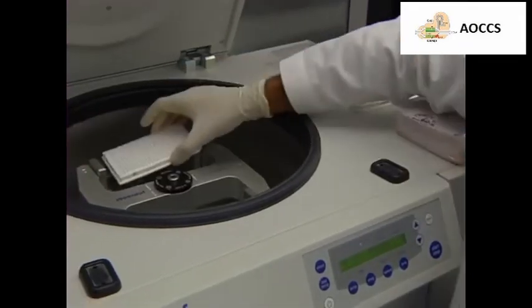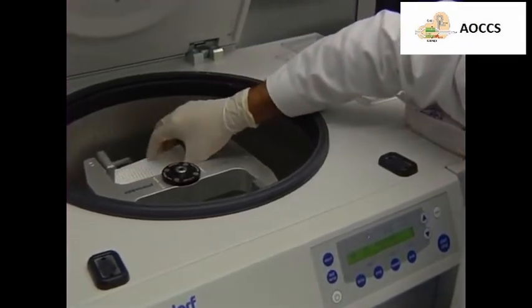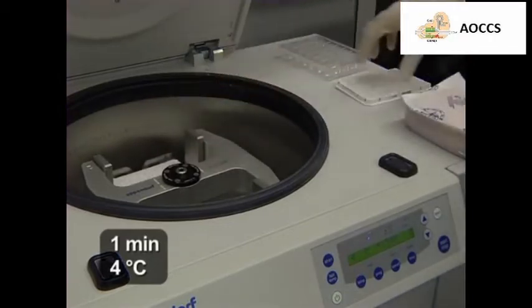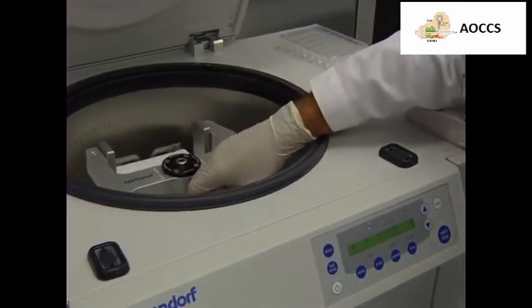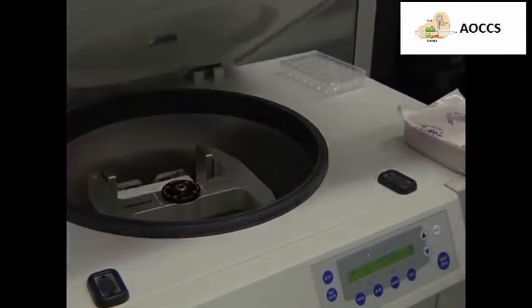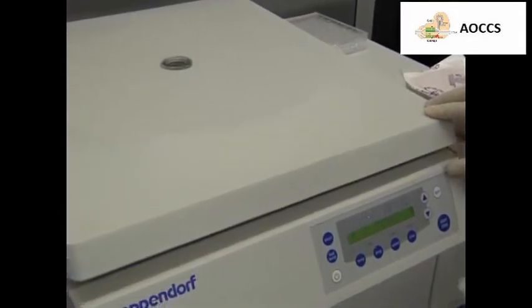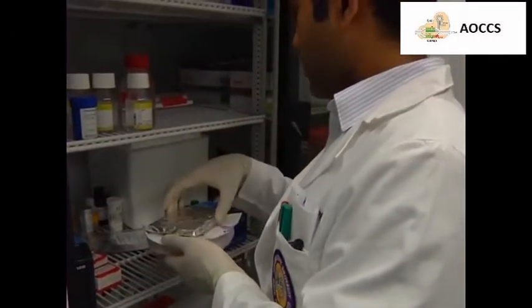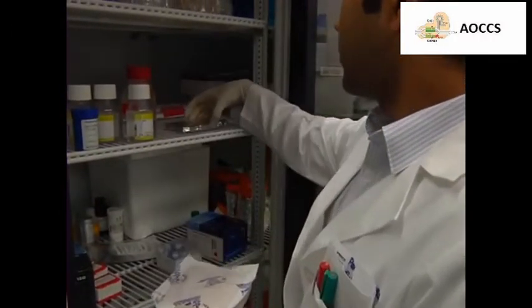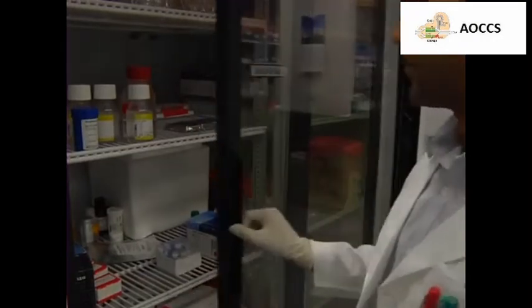After adding the MasterMix, briefly spin the plate in a refrigerated centrifuge at 1,500 times G to pull the solution to the bottom of the wells, mix the samples, and remove air bubbles. To pause the experiment at this point, store the reactions in an area protected from light at 4 degrees Celsius for up to 24 hours.